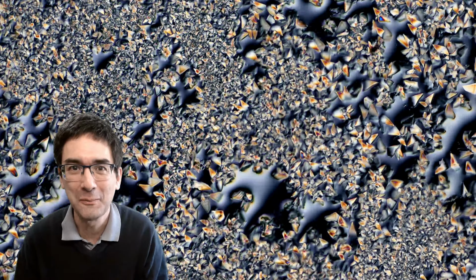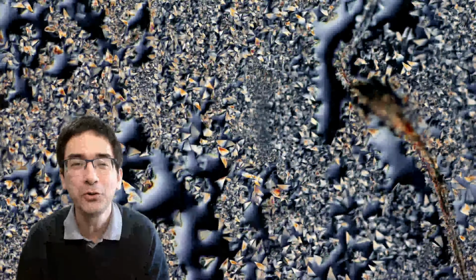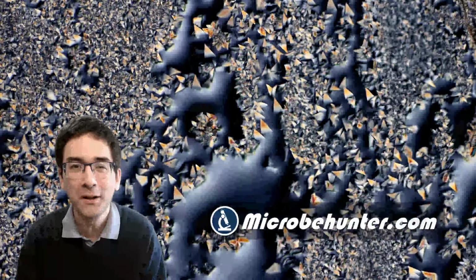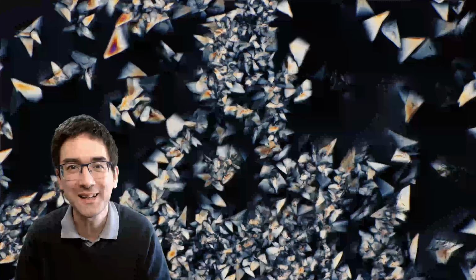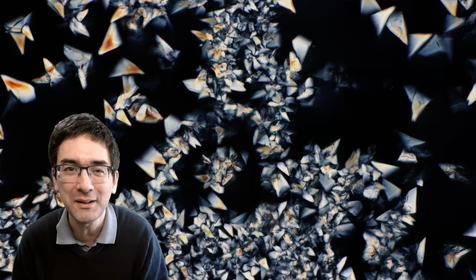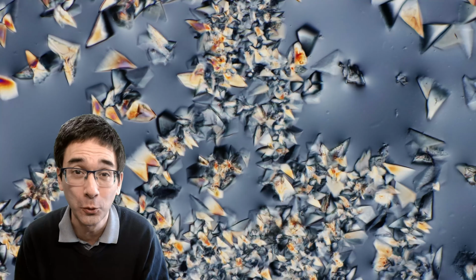So hello and welcome, Microbehunter here again, and today I'm going to put something slightly more unusual under the microscope. I'm going to put a little bit of Coca-Cola, some Coke, under the microscope. And as a matter of fact, what you see behind me, these beautiful crystals, these are indeed crystals of Coca-Cola.